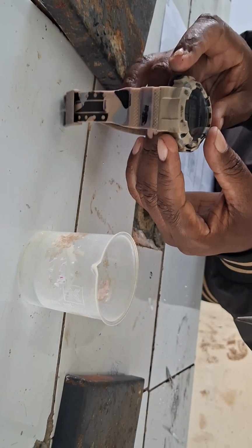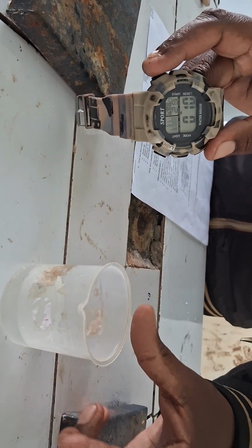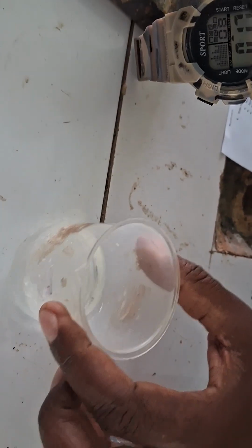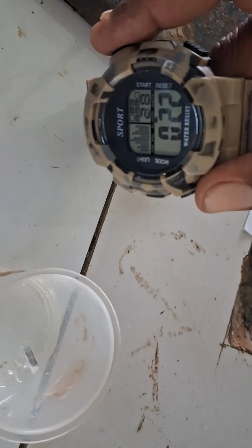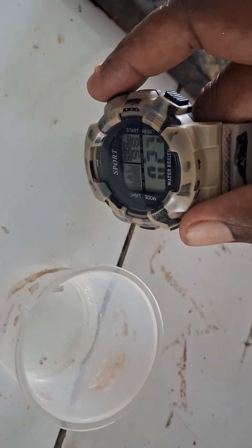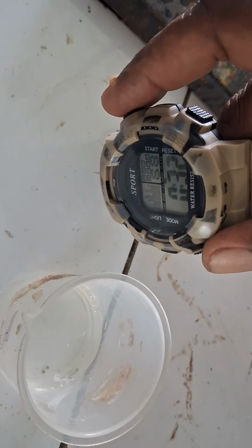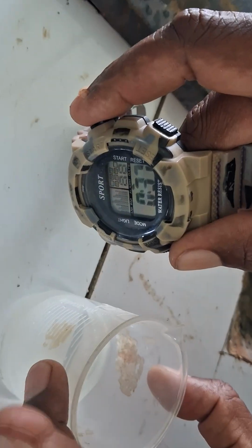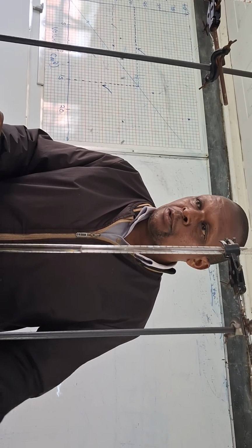When the experiment ends, we'll stop the stopwatch. So immediately focus. When the magnesium produces no more bubbles or is all consumed, we'll stop the experiment. So we do the timing like that. It's almost over. It is less concentrated than the first portion.